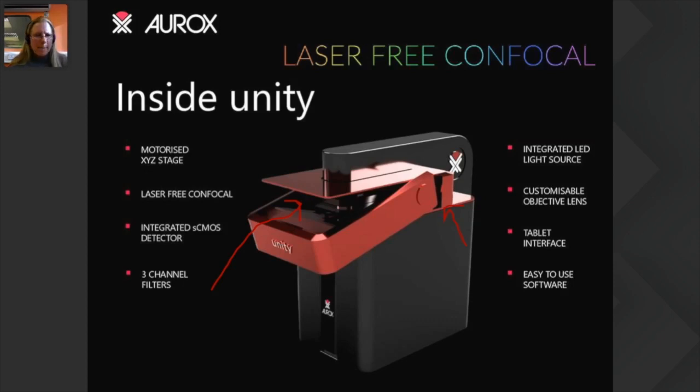What is the resolution? Remus may correct me if I'm wrong, but I think we achieve about 0.9 microns Z resolution. But maybe Remus can come online and answer. Yes, it's actually better than that. But yes, it's in Z. It's definitely very much comparable with the point scanning confocals. Laterally, you get the same kind of thing that you get in a confocal. Theoretically, we have a slightly better resolution in the wide field, but in practice, it's about the same as wide field. But ultimately, as always with all these things, it's dependent on objective lens numerical aperture. That's all there is.